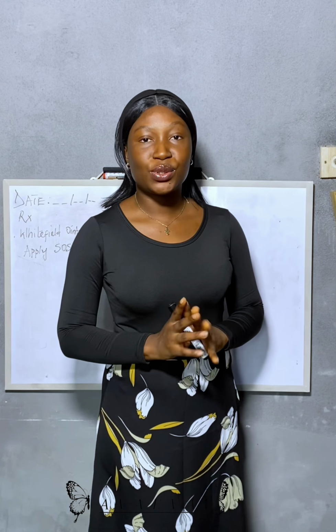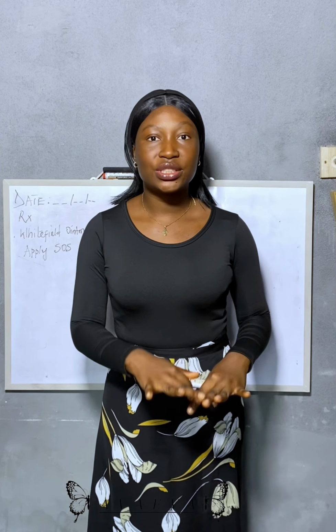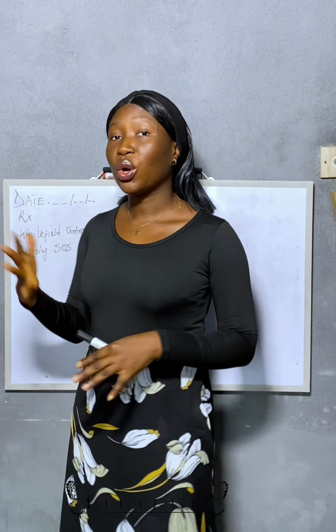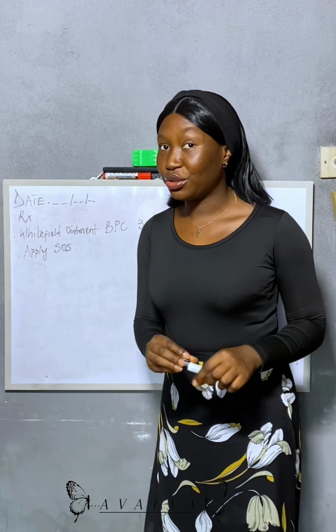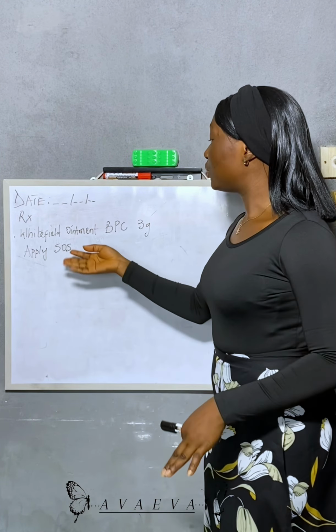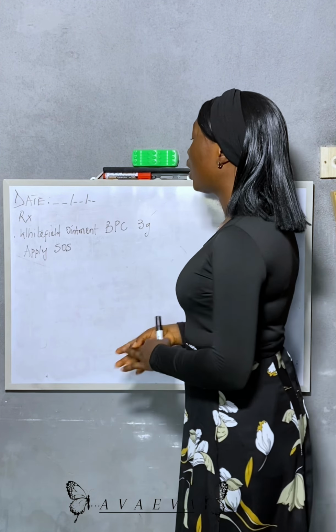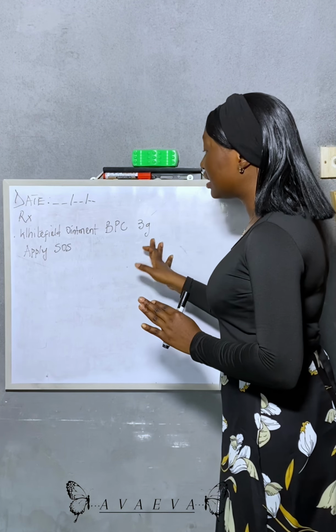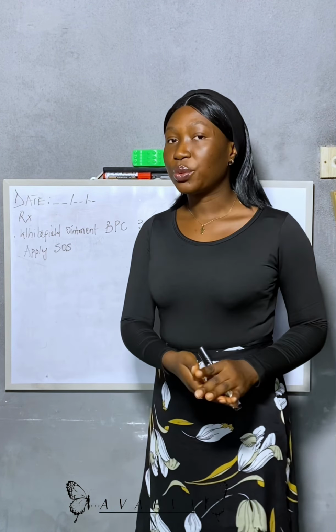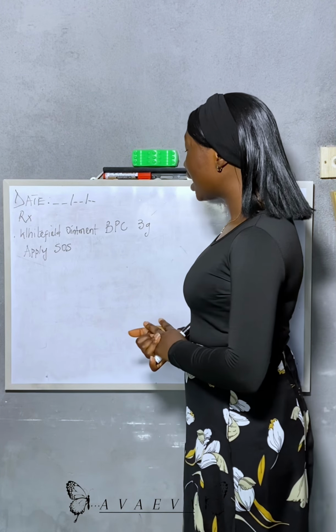On today's episode, we are going to be looking at another external preparation, ointment. Here we have our date, which is mandatory, do not forget. And we have our question here: Whitfield ointment BPC, send 3 grams. And for direction, we have apply SOS.